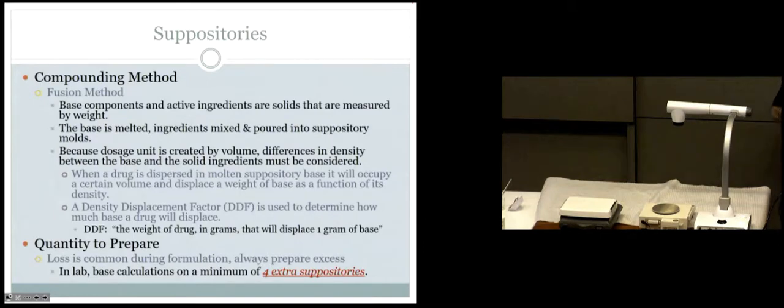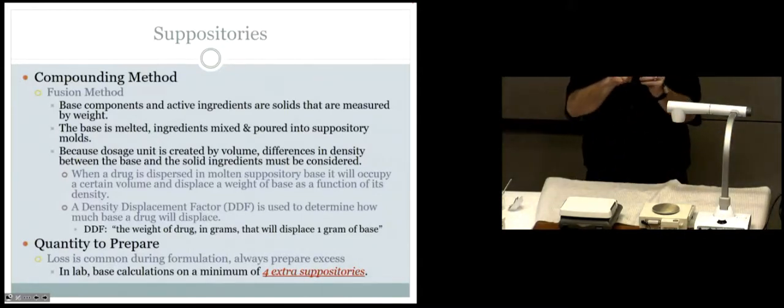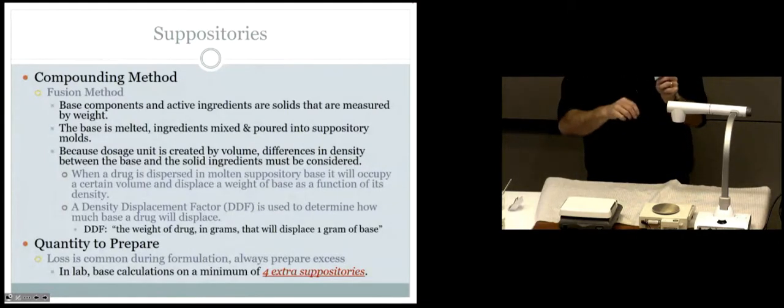All right? But how do we dose drugs? Do we dose rectal or vaginal suppositories by volume, or do we dose them by what? Weight. They're dosed by weight. So we have a problem here that's leading to this whole discussion about the density displacement factor. So here's the deal. I could pour this all the way to the very tippy top with liquefied base, okay? Now, if I started to add some of my drug into that absolutely full volume cavity, what would happen to the base as I put my drug into it? What will the base do?